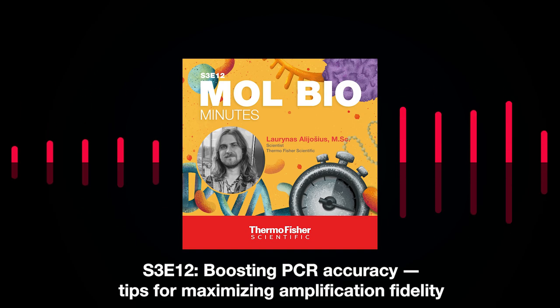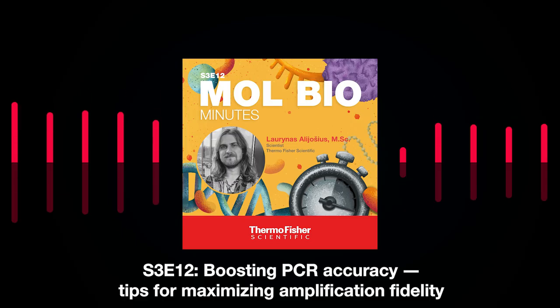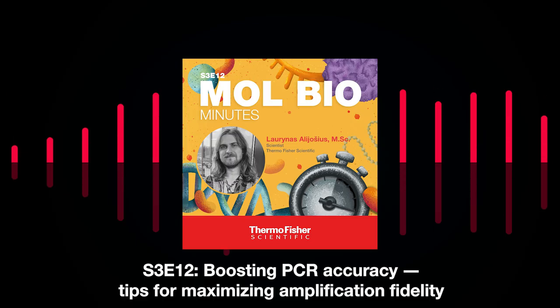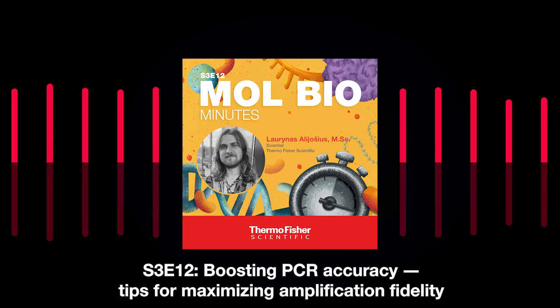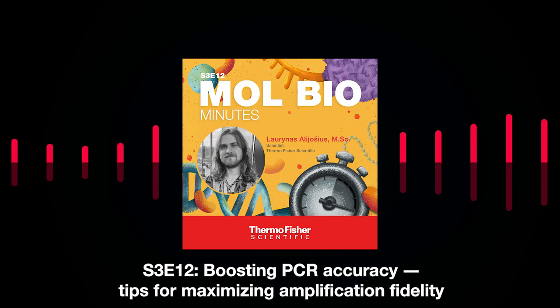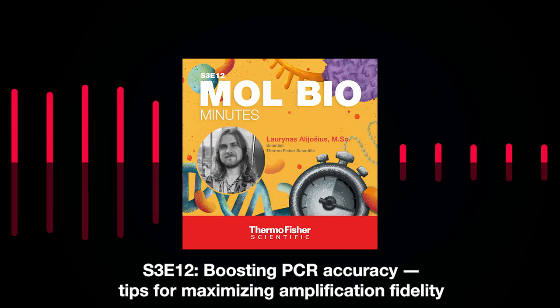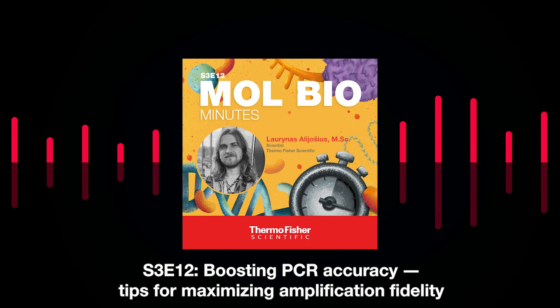For your reaction mix, the most convenient option, we believe, and what we love to do in our lab, is to use ready-to-use PCR master mixes or buffers, because in that case we have an optimal reaction mix composition, and we are avoiding additional pipetting errors that we don't need, or we lower the risk of contamination of our samples. And also, we just save some extra time for coffee or for some chatting. So that's nice, or just to go home earlier.